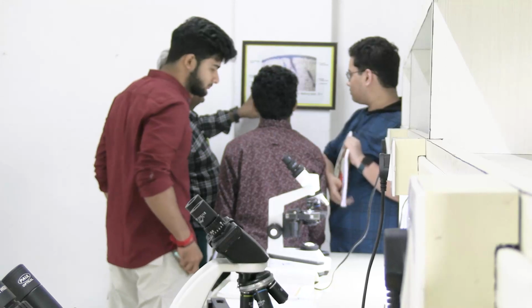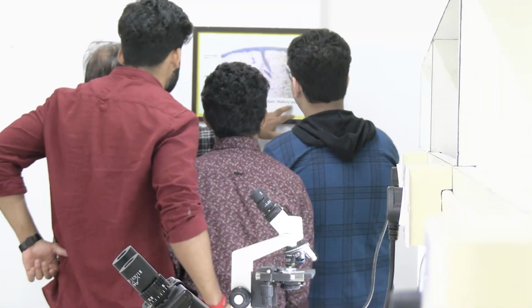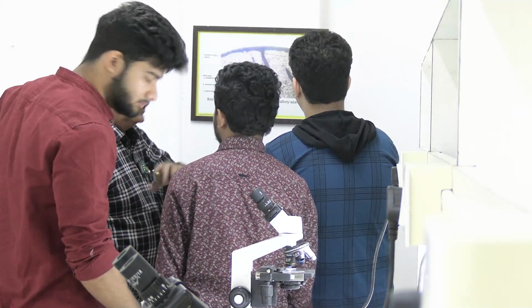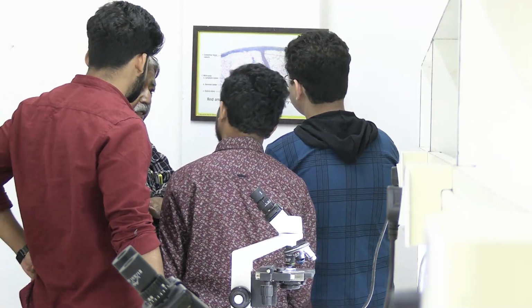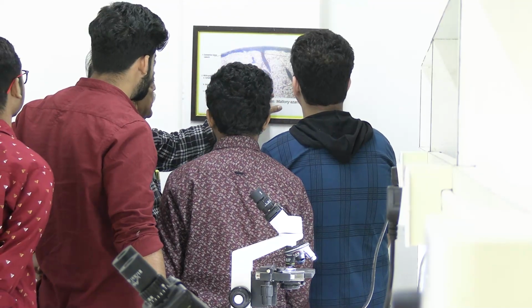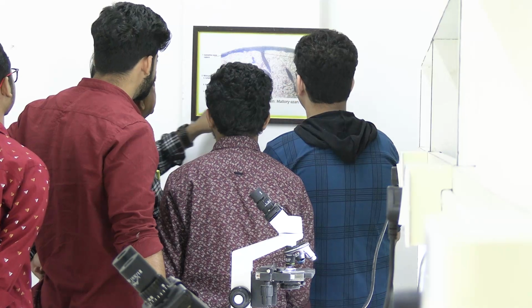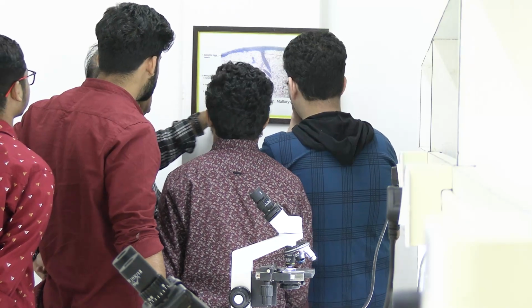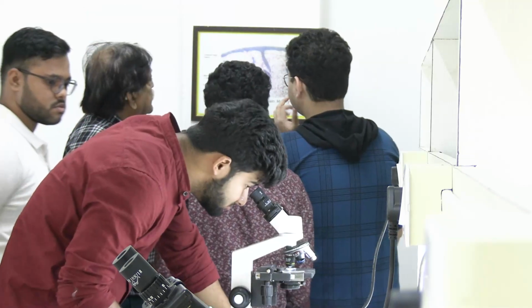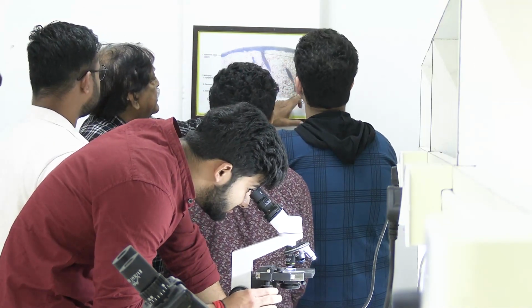Stain. These are special stains, red and white pulp of the spleen staining Mallory Azan. And that is H&E stain. So you will be given H&E stains, but the picture is the connective tissue, the connective trabeculae, and the red pulp. This is the white pulp: lymphatic nodule, germinal center, central artery, and red pulp: venous sinuses and splenic cords.